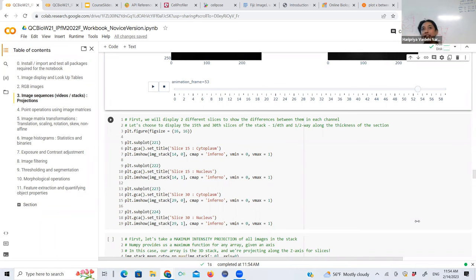The technique works such that you illuminate not the entire sample, but you manipulate your light so that you're cutting through the sample, shining almost a very thin torch through a very thin section of the sample. Like if this is the slide and your cells are sitting on it, normally when you shine the light, it shines through the whole thing. But in this technique, you can shine it through a thin slice like this, and you take only that image. So you're not going to get anything from here or here. And likewise, you can do this. And if you move that slice slowly all the way through, then you essentially get these stacked images. That's called what process? Confocal imaging.